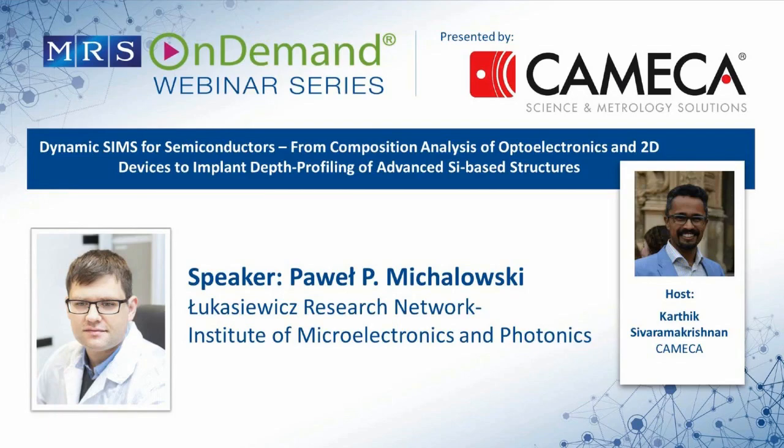There's one that says, great talk. For the quantum well nanostructures described here, is the old sample rotation method useful to improve the depth resolution at these length scales? The sample rotation, but then it wouldn't be very well possible to obtain the three-dimensional image, because I would say that it would make it at least very difficult. And I may also mention that the tool that I'm using, the sample cannot be rotated during the analysis. So I'm not perfectly sure, I would say.